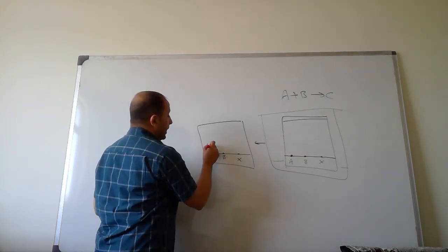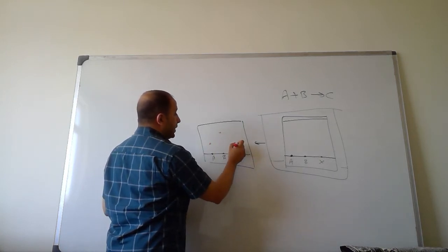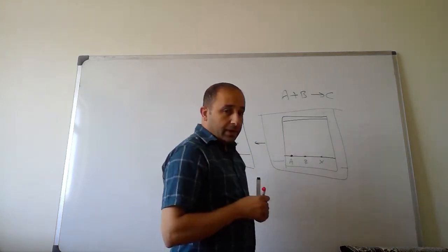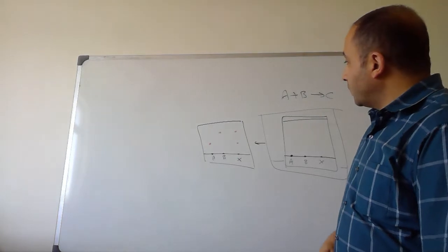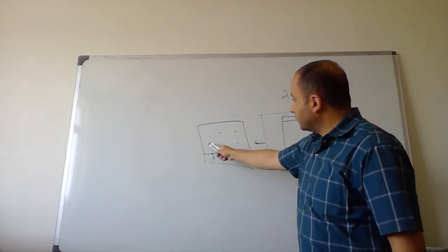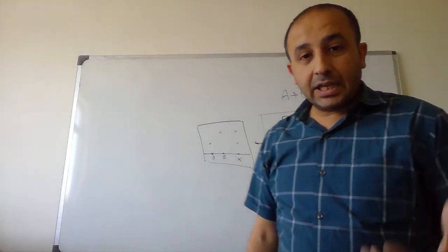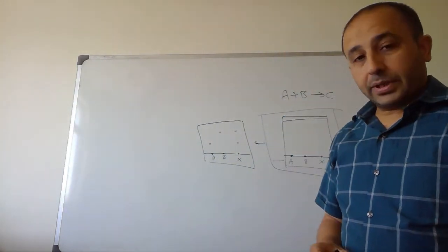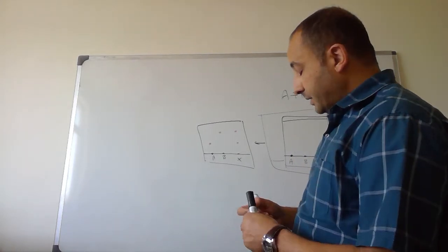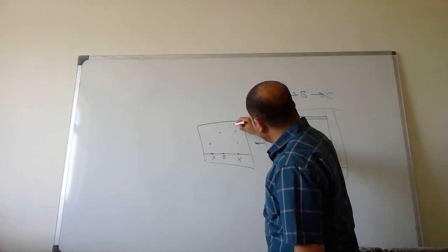Assuming that A migrates to this point, B to this point. Now, if the mixture from the reaction vessel just gave two spots, this means that we just have A, which is co-aligned with the reference material here, and B. So there is no indication for the product. Assuming that we increase the time for a certain time increment, and we obtain a new spot.